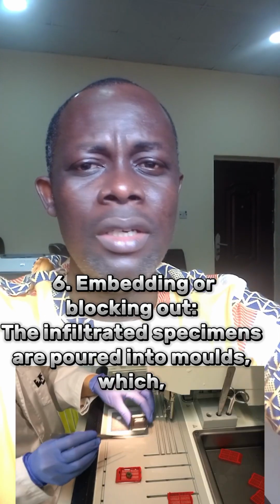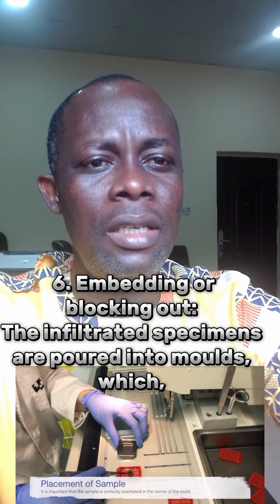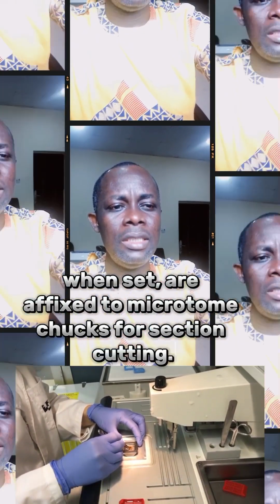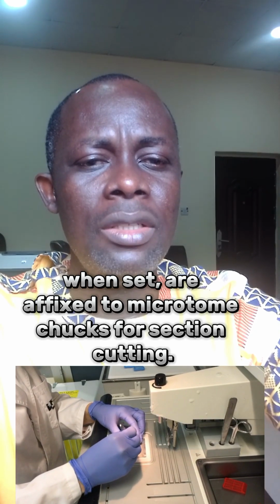The sixth step, embedding or blocking out. In this stage, the infiltrated specimens are poured into molds, allowed to set, and then affixed to microtome chucks for section cutting.